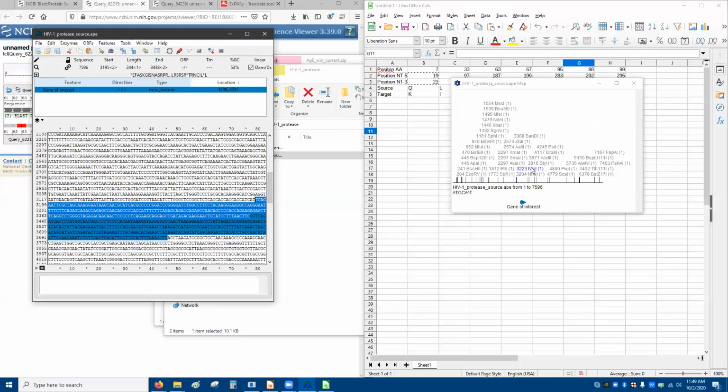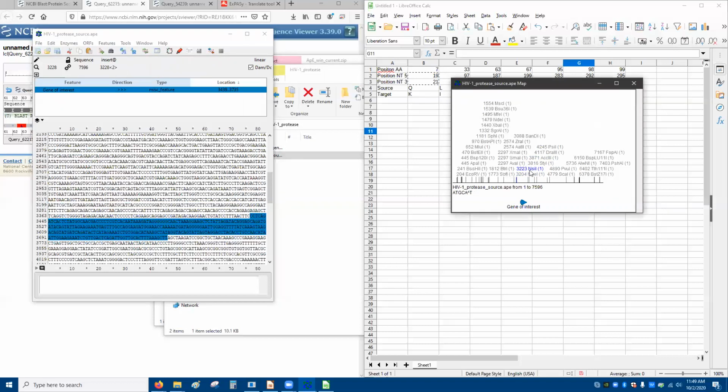This is going to cut out more junk. So what we can do is we'll just use NSI1. So that would be ATGCAT.